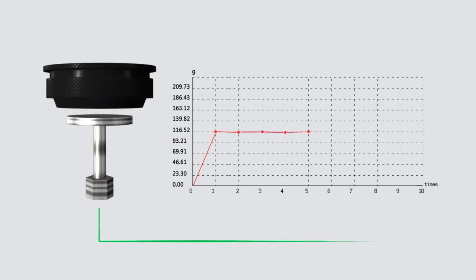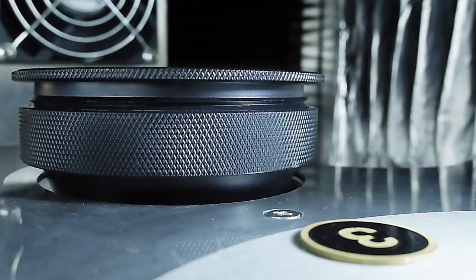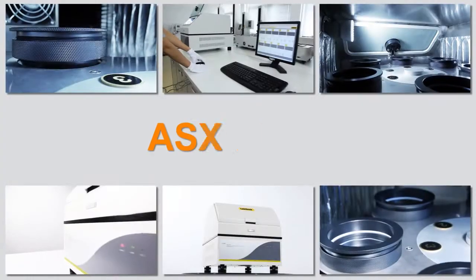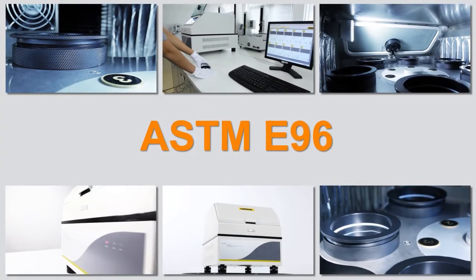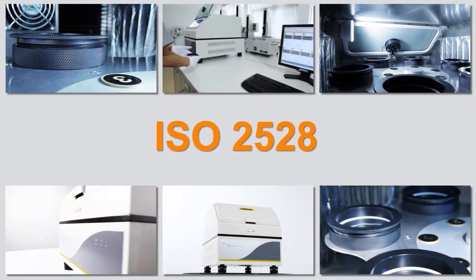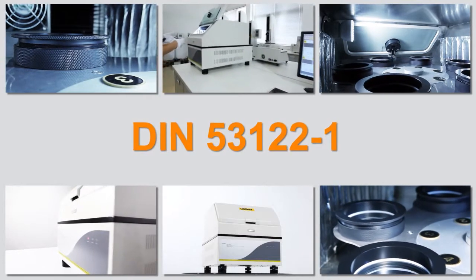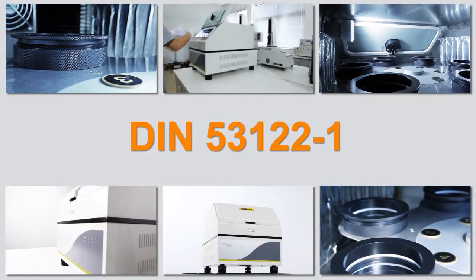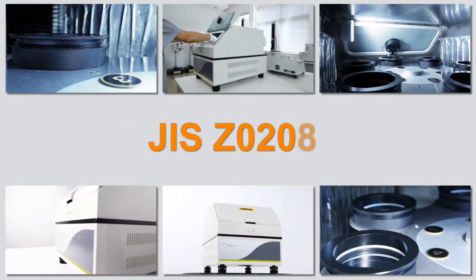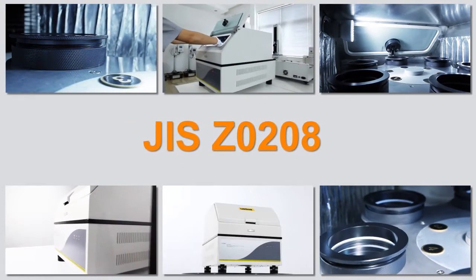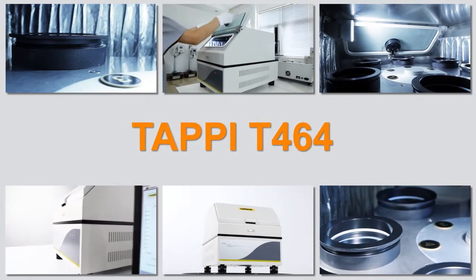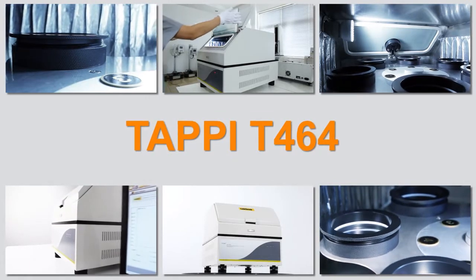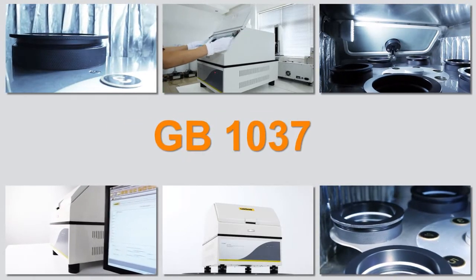The testing principle complies with ASTM E96, ISO 2528, DIN 531221, JIS Z0208, TAPPI T464, GB1037, YBB 0009-2003 and other standards.